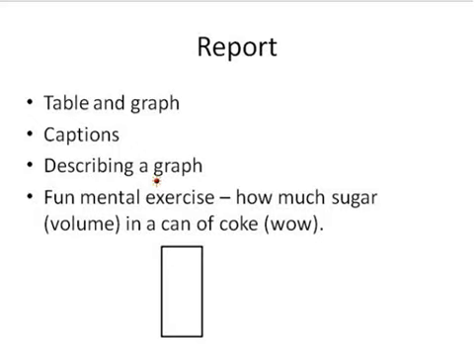And then below the graph, you want to tell the person that's reading this document what they should think about the graph, what they should take away from the graph. What does the graph show? And so things like it shows that there's a linear relationship between density and amount of sugar added. That's a pretty important conclusion, and that is really what allows you to do the linear regression and actually get the unknown amount of sugar in Coke. So you should make comments about what the graph shows you.